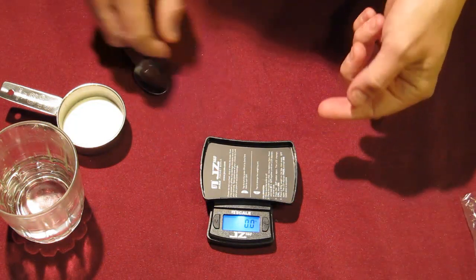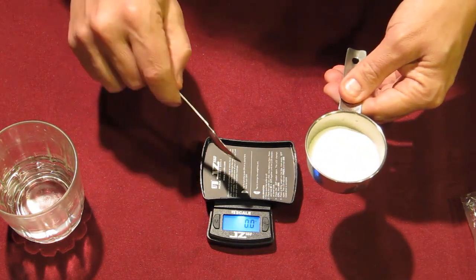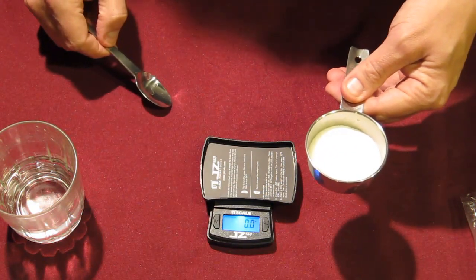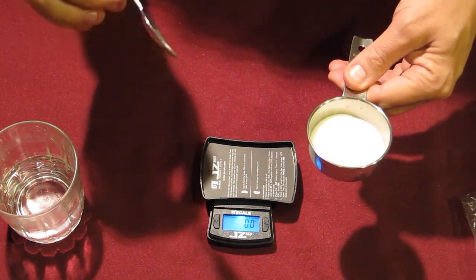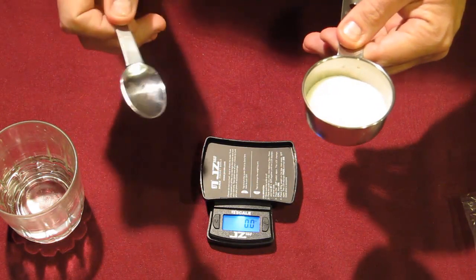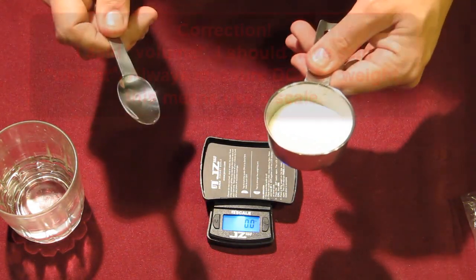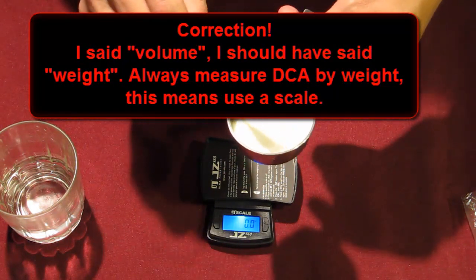Once again push the button once — the scale will reset to zero and ignore the weight of the tray. Now what you simply do is take your DCA and put it on the tray and measure out as much as you want. It's very important that you measure DCA by weight and not by volume. Volume is how much space something takes up, and that's not a reliable or accurate way to measure things.